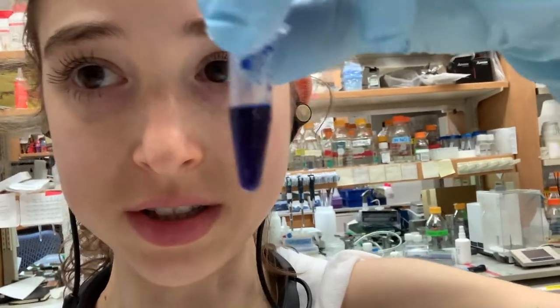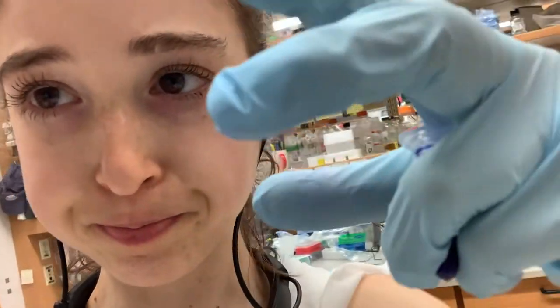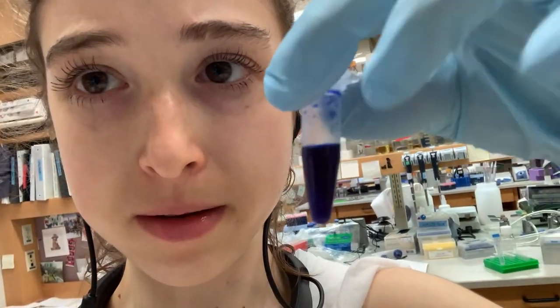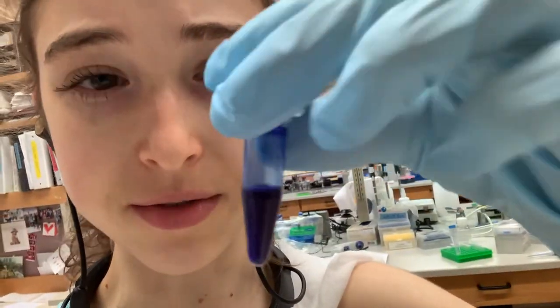The 4x loading buffer basically has SDS (the detergent), a reducing agent, and the tracking dye. I make a large batch, aliquot it into 1 mL portions, and keep them in the freezer. The reducing agent keeps things in a reduced environment so that cysteines don't form crosslinks — it would break up any crosslinked dimers. The reducing agent can go bad over time and become ineffective, so if you're worried about that, add fresh reducing agent right before you run.